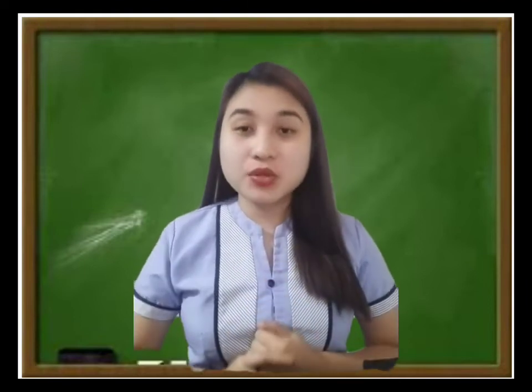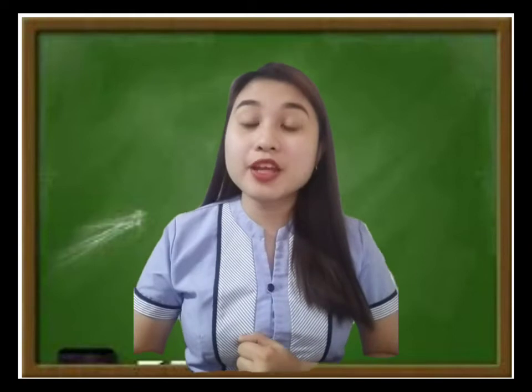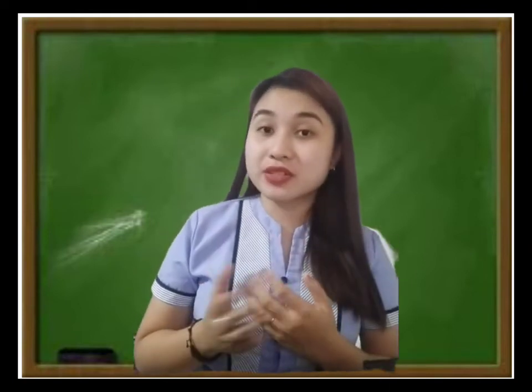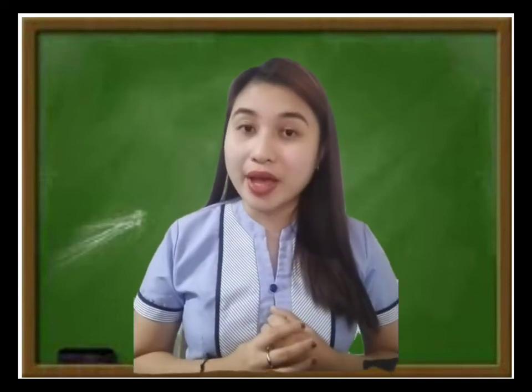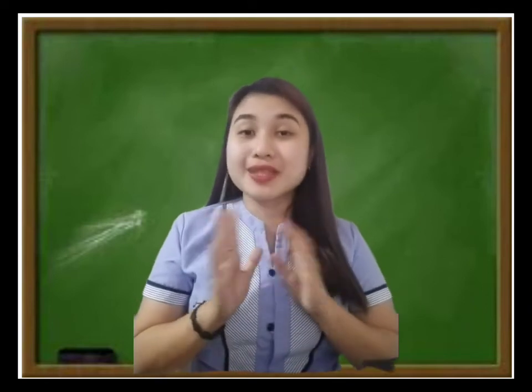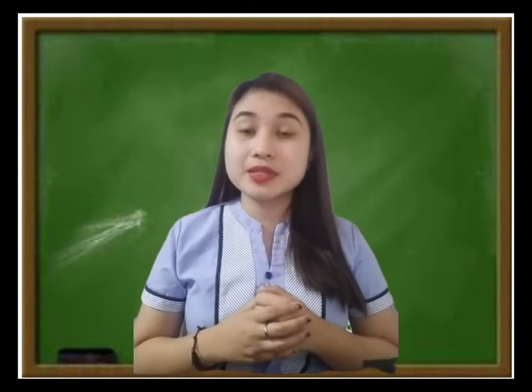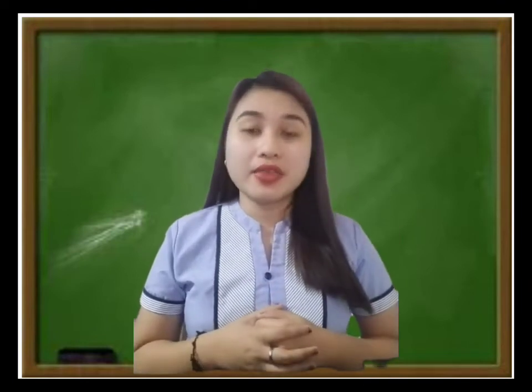To sum up our discussion, can we review some of the topics? Okay, so always remember that the microscope is very important to our life, to the scientists, and to us. Why? Because scientists use the microscope to discover something very important and productive for us humans. So the microscope helps us to see the microorganisms that we cannot see with our naked eye.